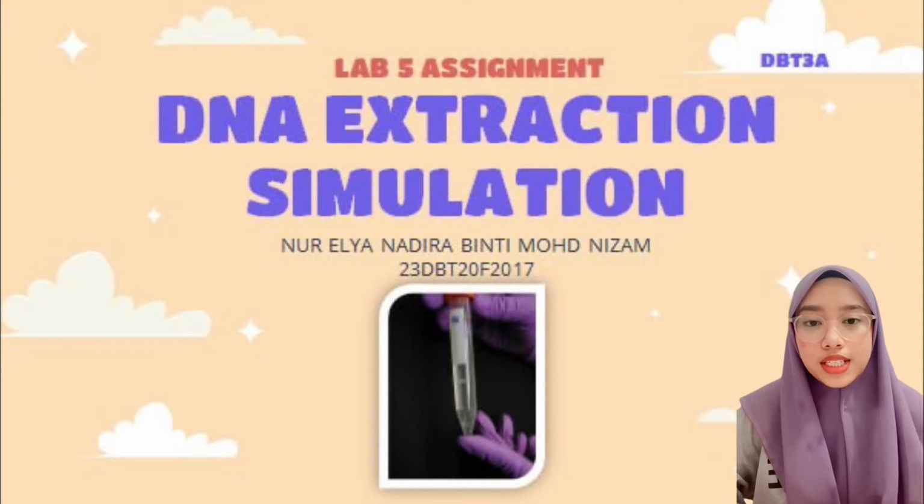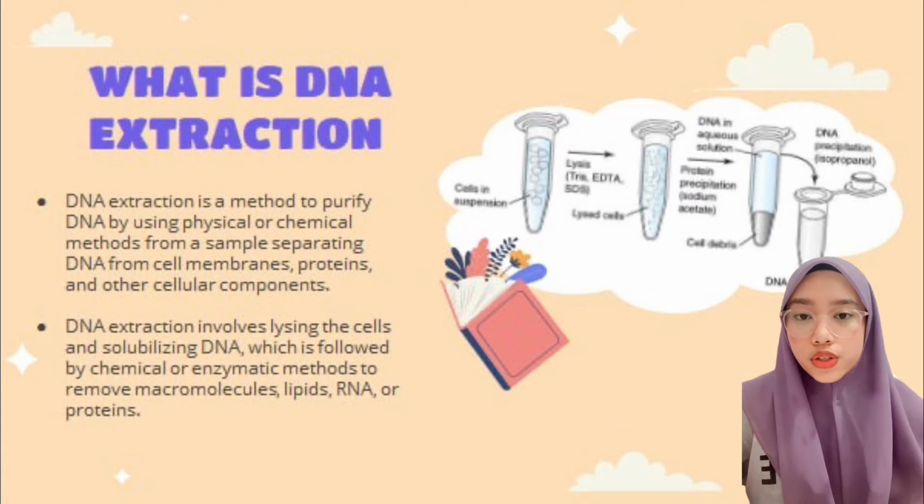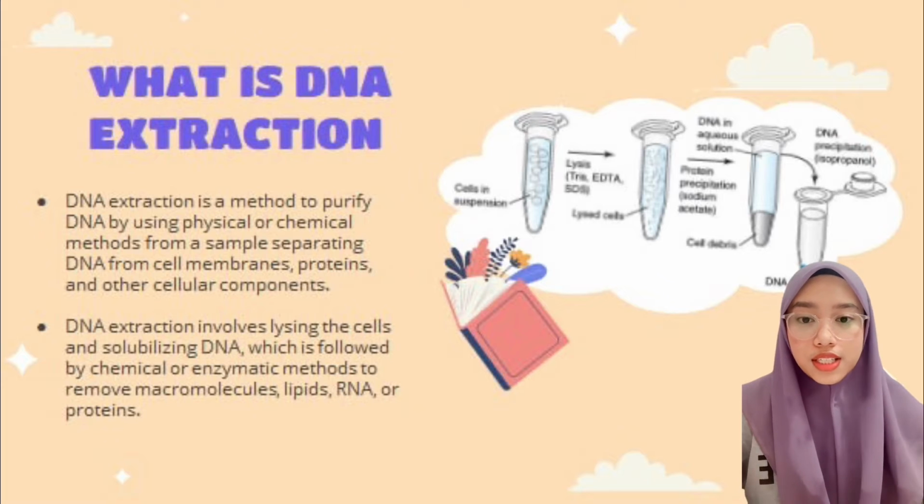Today, I would like to present a virtual lab of DNA extraction simulation. So, before we begin, we need to know what is DNA extraction. DNA extraction is a method to purify DNA by using physical or chemical methods from a sample, separating DNA from cell membranes, protein, and other cellular components.